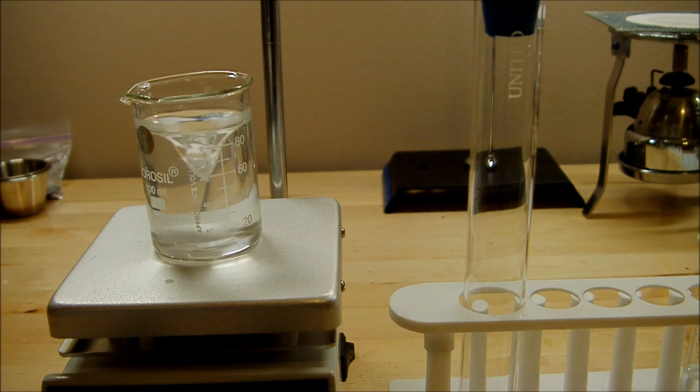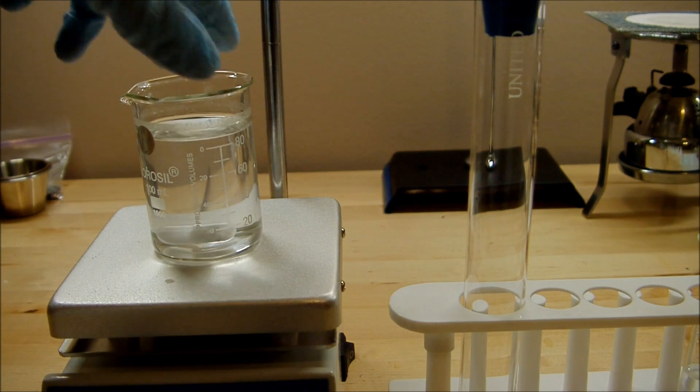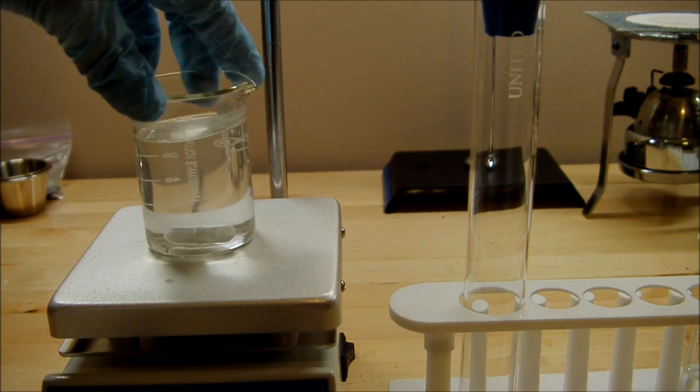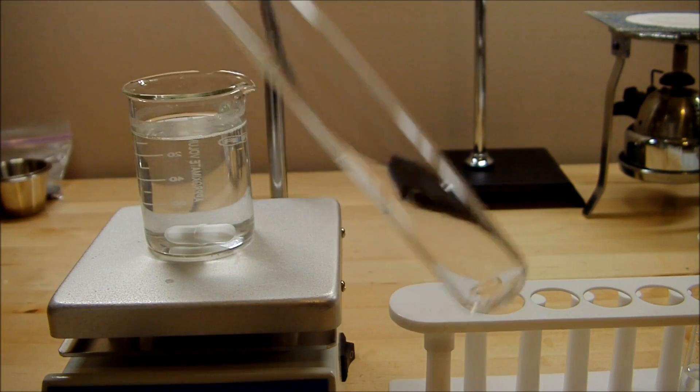Now everything's been dissolved completely and the solution's cleared up. So I'll turn off the heat and the stirring, and then we'll pour it into this jumbo test tube that I have here. And this will be the container for the storm glass.